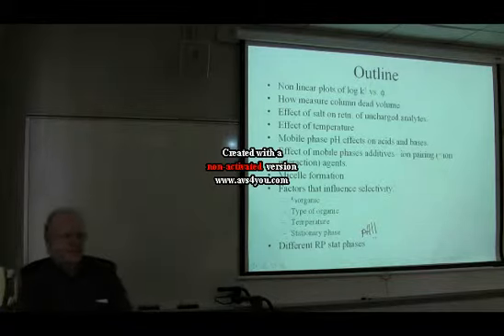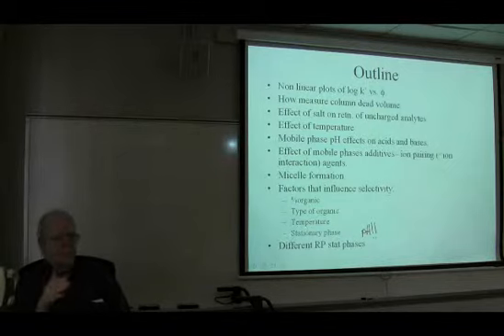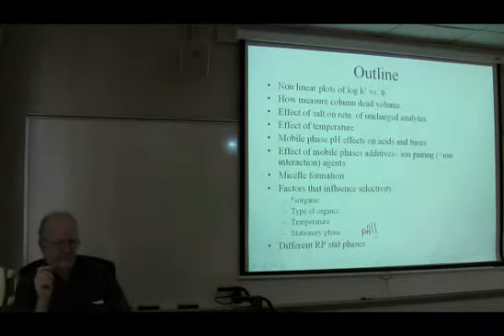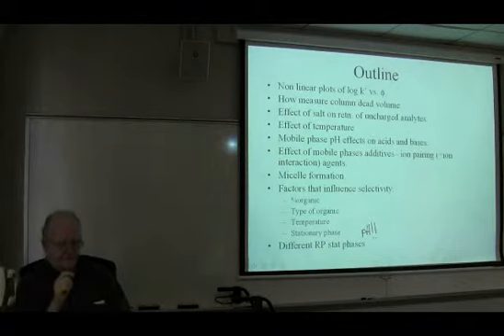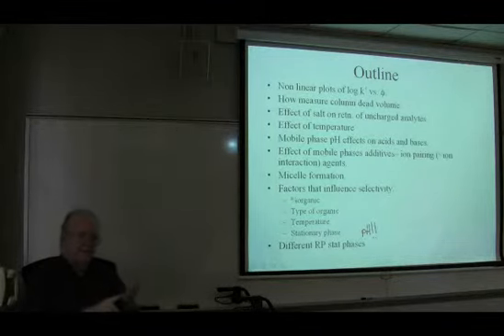The other thing we talked an awful lot about was the organic modifier. That's the stuff that you mix with water that allows you to vary retention. The more organic modifier, the lower the retention, generally speaking. I'm going to show you some exceptions to that quite soon. But the common modifiers are methanol, acetonitrile, THF, isopropanol.